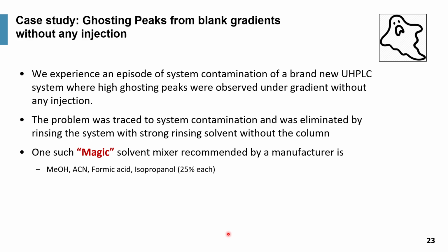I want to show a couple of case studies. Okay, ghost peaks are to be expected. A small number of ghost peaks will emerge from your blank injection, but they should not be too big. They should be less than 5 milliabsorbance units.